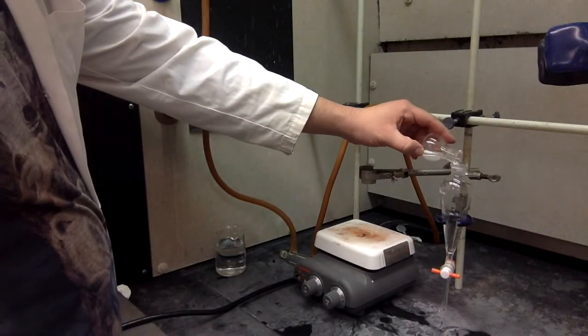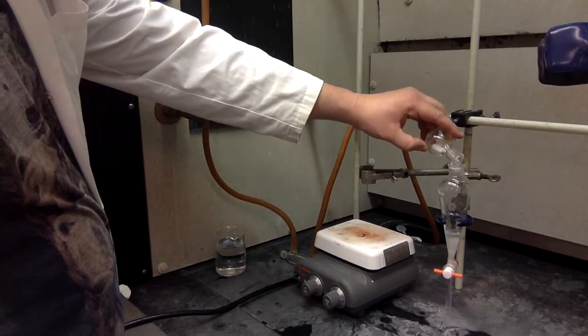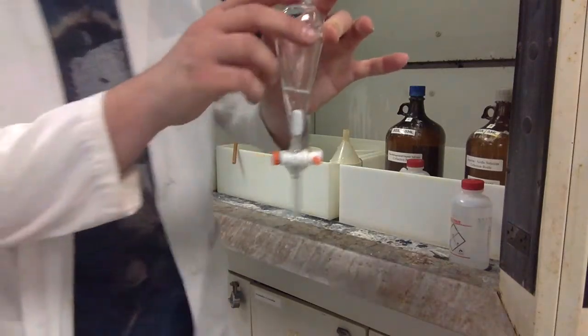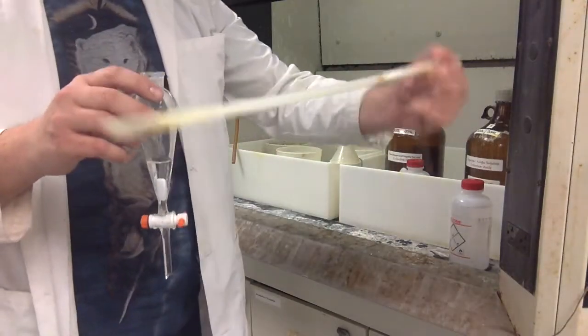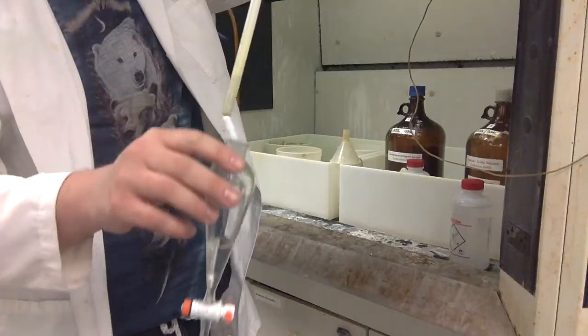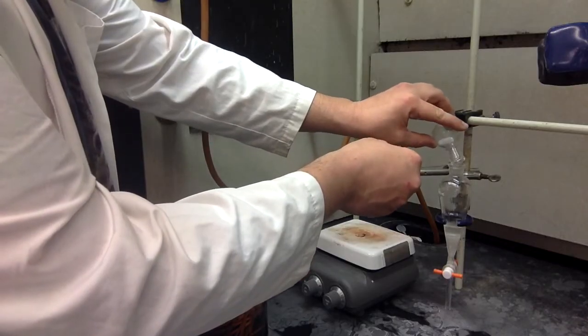You can see me decanting the reaction solution into the separatory funnel. Notice I'm using a pipette to stop the stir bar from falling in. If your stir bar does fall into the separatory funnel, don't fret too much. All you have to do is come to the waste hood, and there is a magnet on a stick that will help you pull it out. Just like that. Rinse the round bottom with a little bit more ether, add it to the rest.